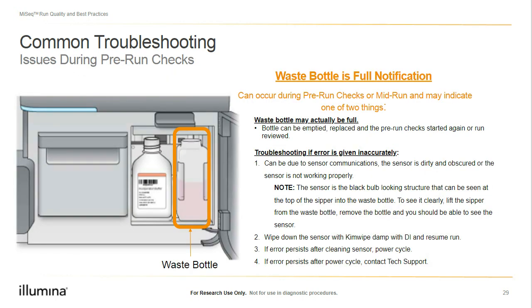While rare, I did want to quickly cover the waste bottle full notification on the MiSeq system. This error can occur at run setup or mid-run. To start, we'll want to ensure the waste bottle is not actually full, and if the bottle is full, it can be removed, emptied, replaced, and either the pre-run check started again or the run resumed.